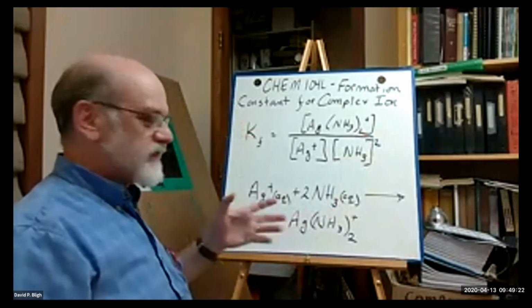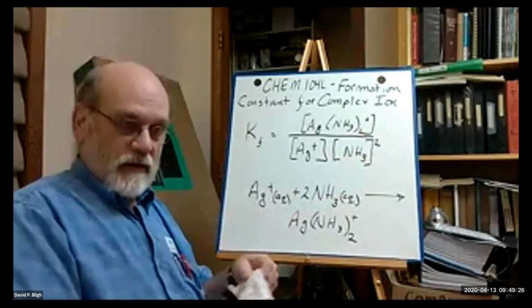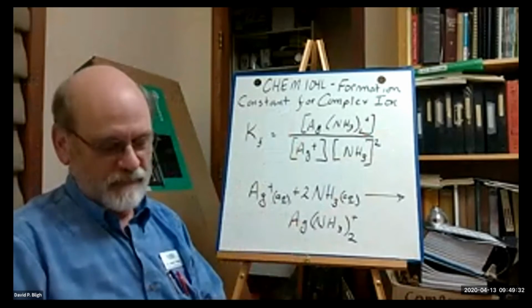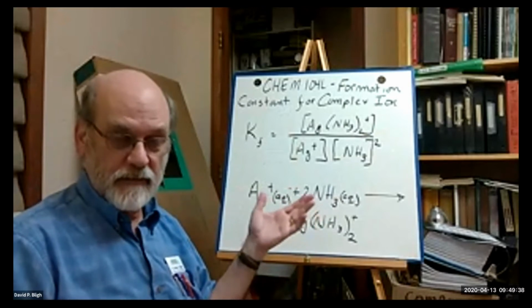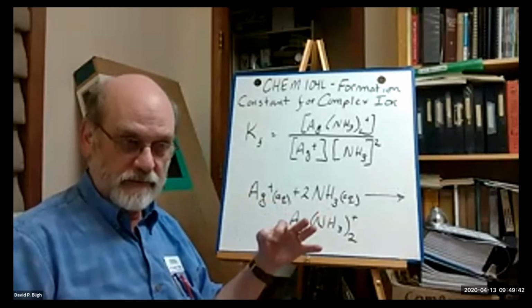So we need some help, right? And here's the way we're going to do it. Remember, dig way back into the dim reaches of your mind, and remember if you had the General Chemistry 1 lab set, we had a lab that we did called Le Chatelier's principle.